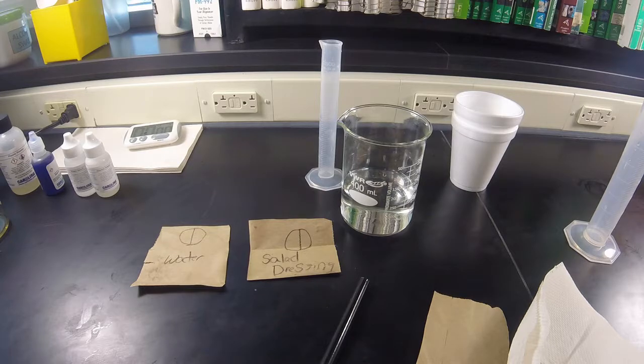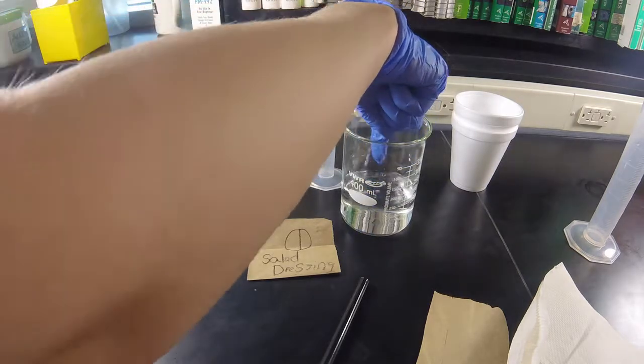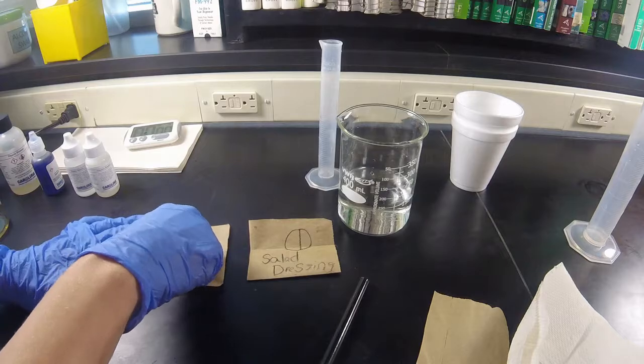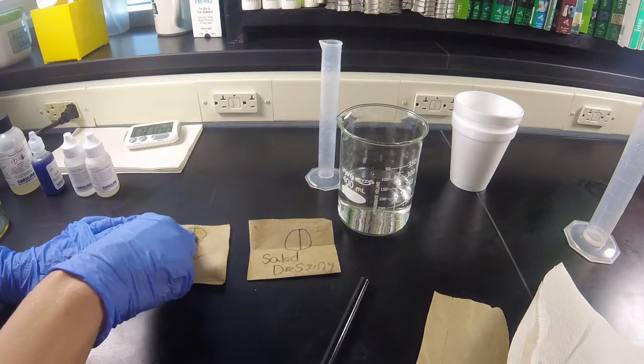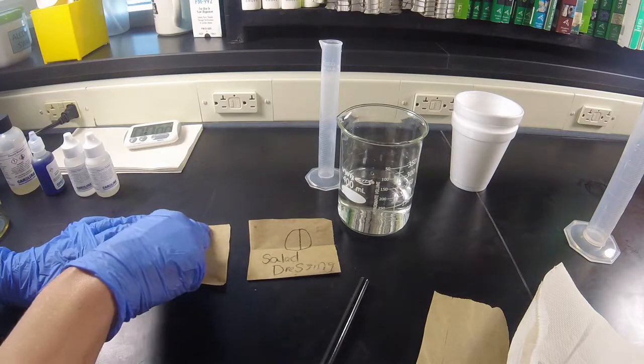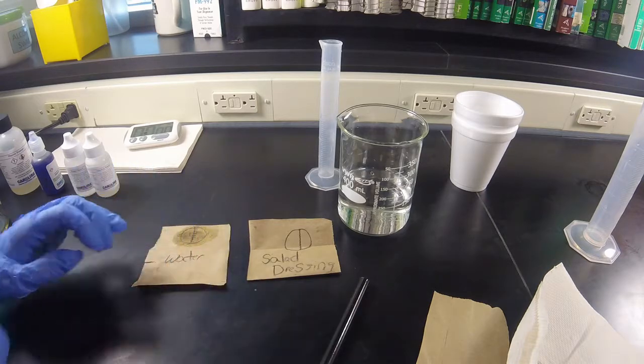First thing you're going to do is place a sample and drop or rub it gently on the appropriate labeled circle or square. The first is water. I rub the water into my circle, or square if you drew a square.